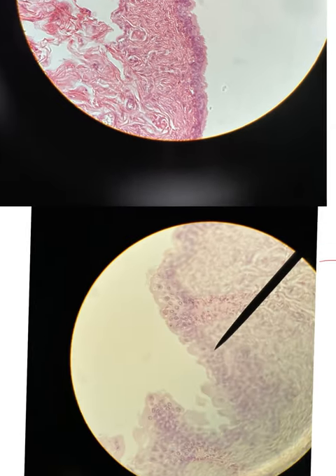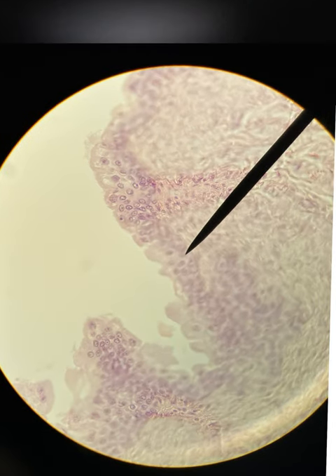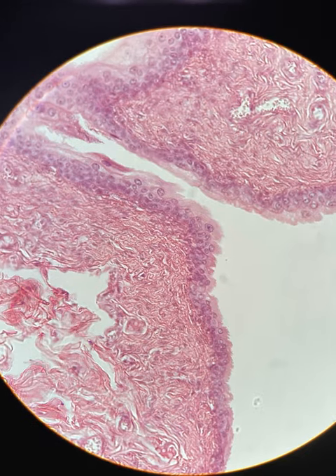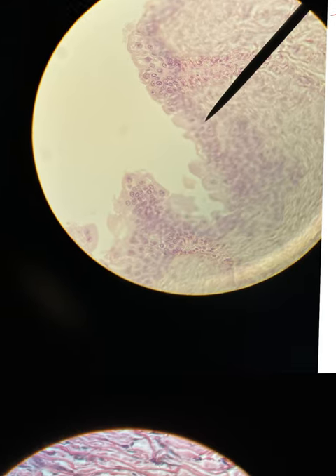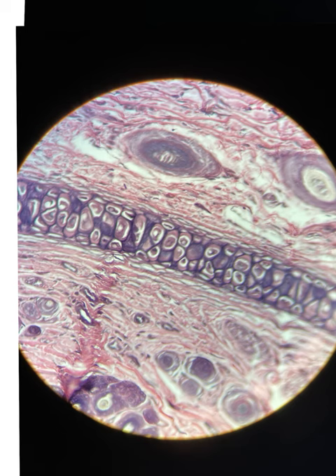Now, I just wanted to show you this because if you don't know, this is the exact same tissue. So if you ever get a slide and you see something like this, you just need to use your fine focus knob, which is probably the only thing you'll be allowed to touch during the practical anyways, so you can adjust it and then you can see it this way. Big difference, right? So if you can't see and you're like, oh, what is this? Use your fine focus.